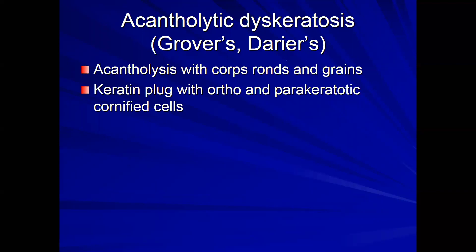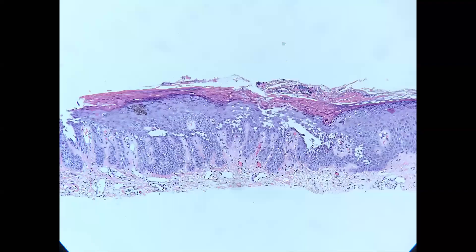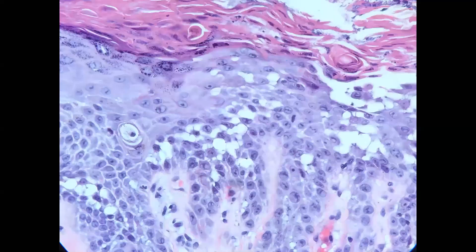In contrast to Hailey-Hailey, the acantholytic dyskeratosis pattern is seen in Grover's disease and Darier's disease. Here you have acantholysis with corps ronds and grains, and you can also see this in a warty dyskeratoma. The acantholysis tends to be suprabasilar — often mistaken for pemphigus — but the key is these dyskeratotic cells resulting in perikeratotic grains, which distinguish this differential from pemphigus or Hailey-Hailey.